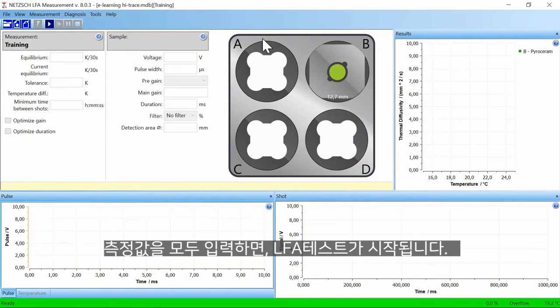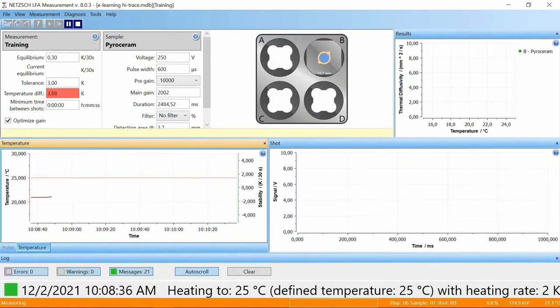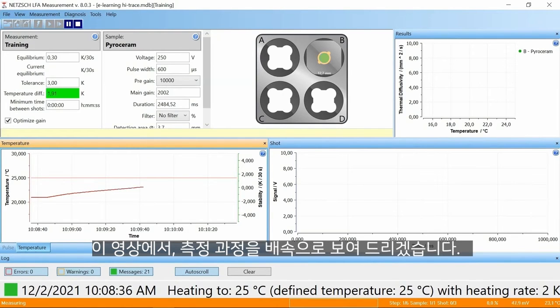After that, the measurement definition is complete and the LFA test can be started. The complete measurement is performed automatically. The measurement is shown accelerated in this video.